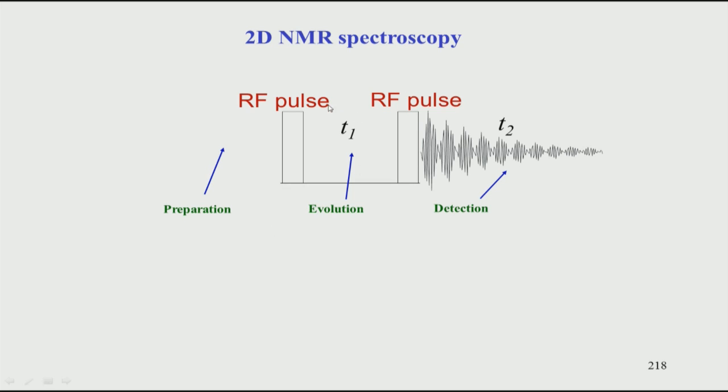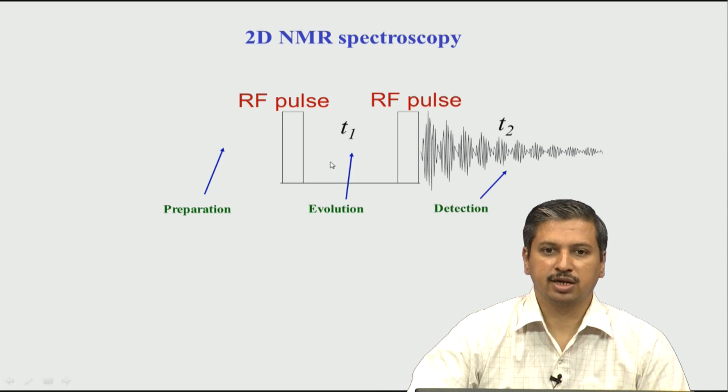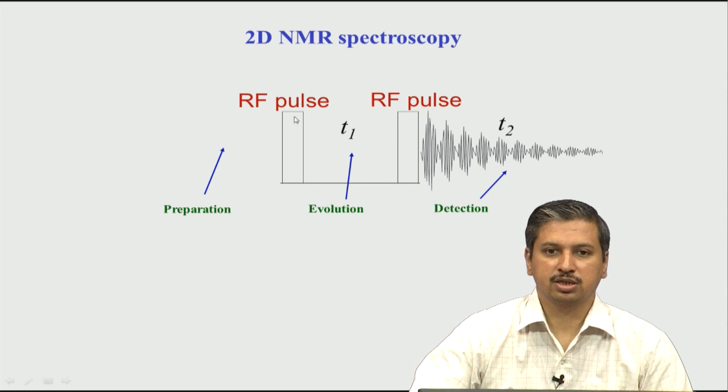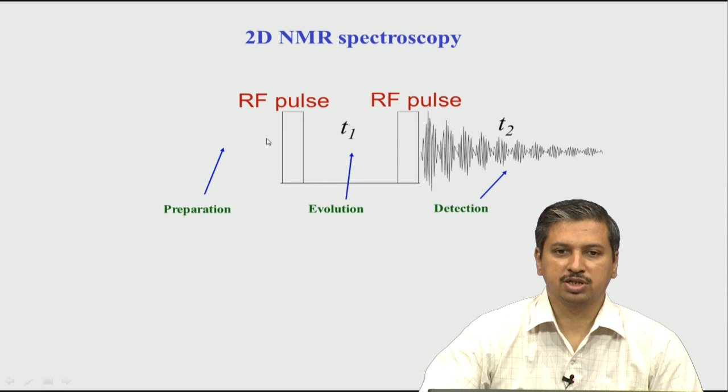So, we saw this is a very simple schematic scheme which has basically an RF pulse applied and then you evolve, and during this period we said we can transfer the polarization or magnetization to B and then it gets detected. Remember, this is non-selective in nature, meaning this is not just applied to one spin in particular, it is applied to all the spins in the molecule.